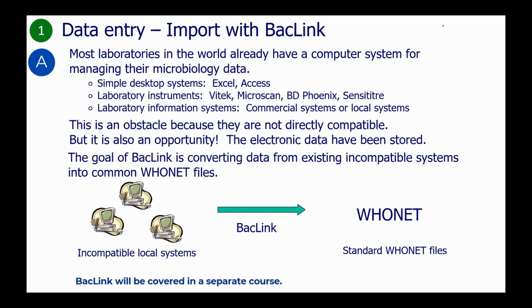These may be simple systems, such as Microsoft Excel, or it may be a laboratory instrument, such as Vitek, MicroScan, Phoenix, or Sensititre. It can also be a local or commercial laboratory information system. On the one hand, these diverse systems are an obstacle because they are not directly compatible with each other. But on the other hand, they are also an opportunity. Laboratory staff have taken the time and effort to store the data in a computer system.